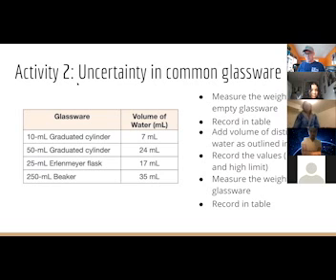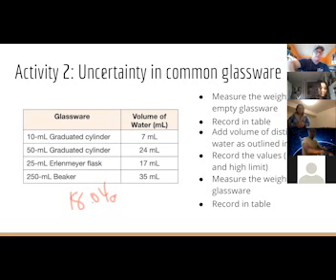But I should have done it the other way. So full, I've got 18.04 grams. So 18.04 grams full.